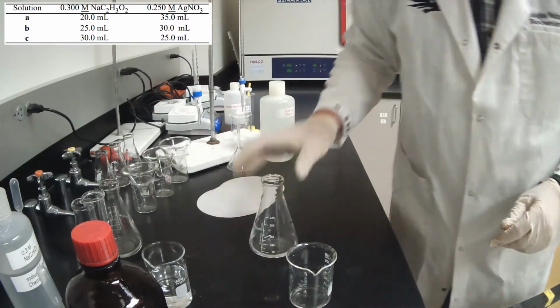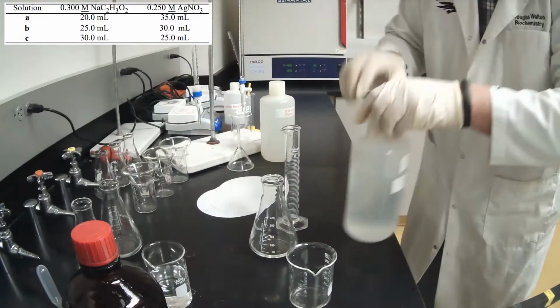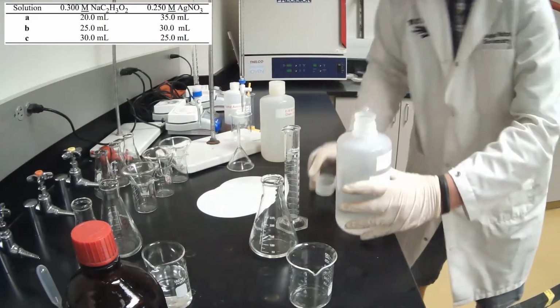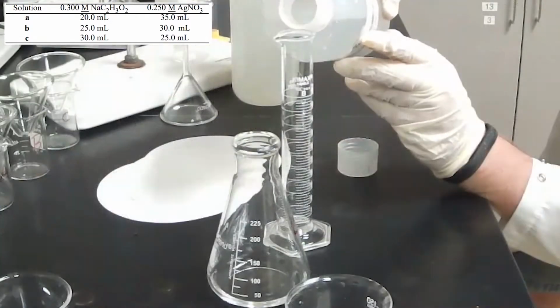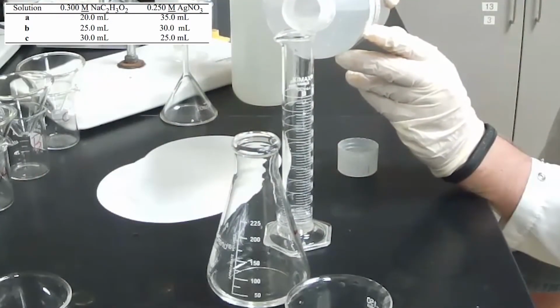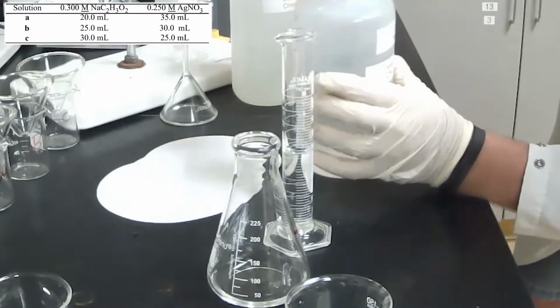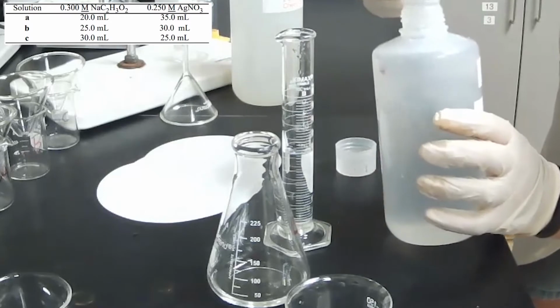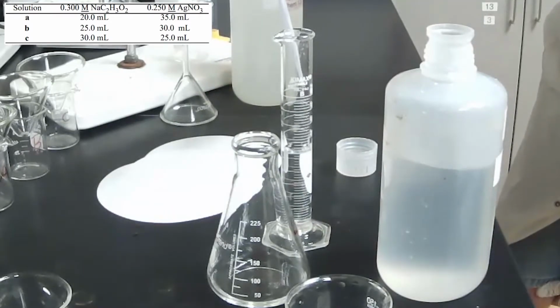I'll go ahead and do C because it's right here in front of me. I need 30 mils. Unless you're either really good or really lucky, you'll need to top it off with a pipette.